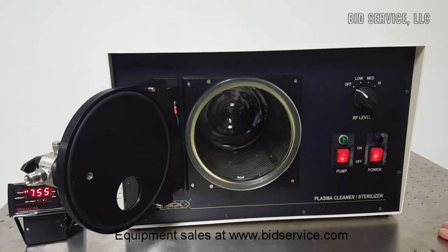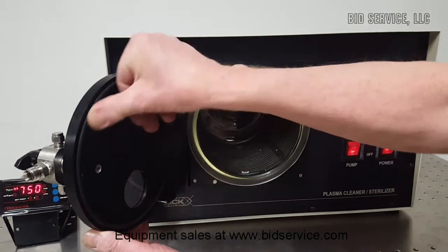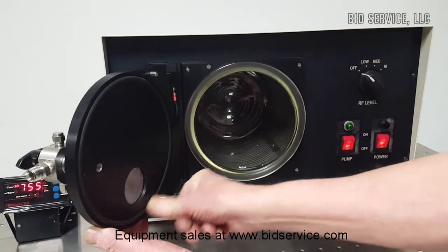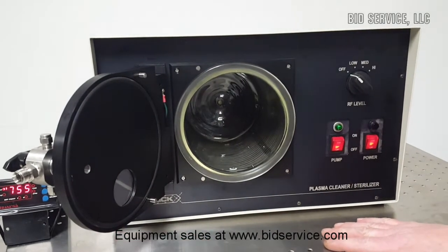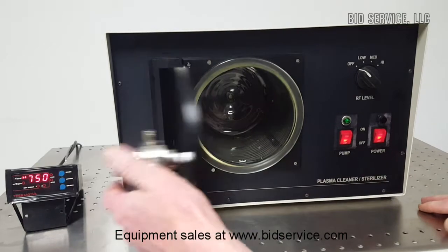This is the Pyrex chamber. Be aware that periodically you should clean this O-ring surface, especially if this has been doing a lot of etching or cleaning and there is residue in there. It can get on the surface and affect your vacuum.